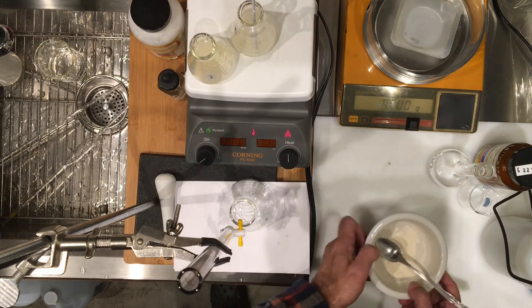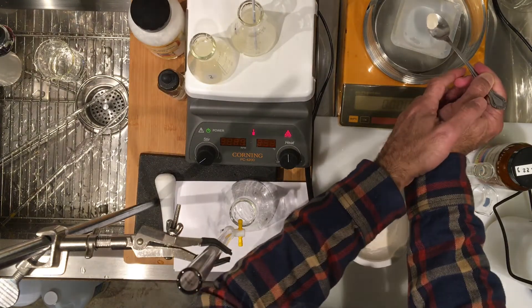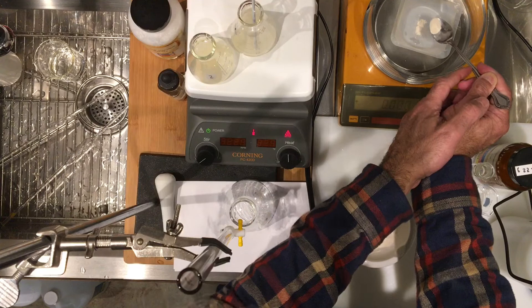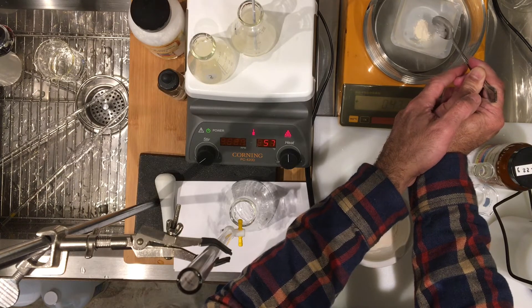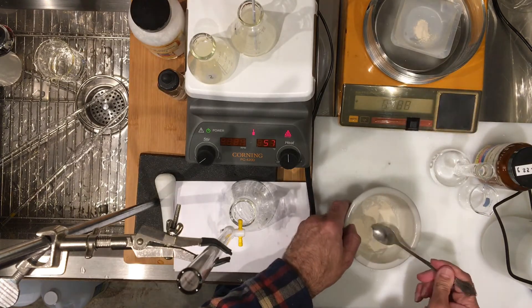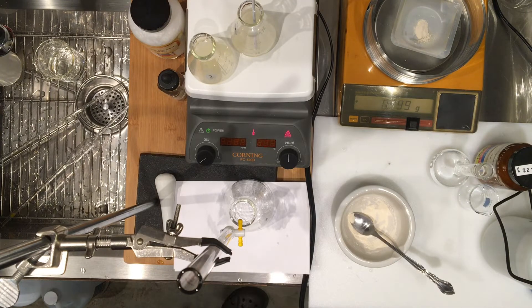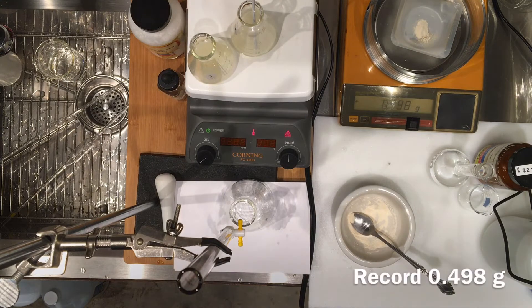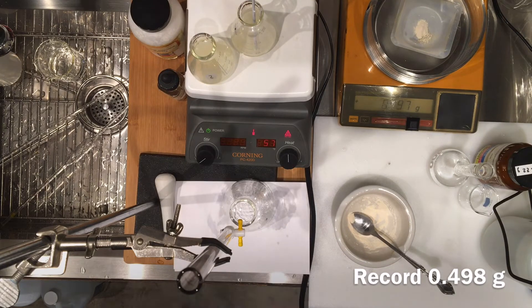Another roughly 0.5 grams for that. That's good enough — 0.499, or 0.498, let's go with that, for our third flask content of the tablet.